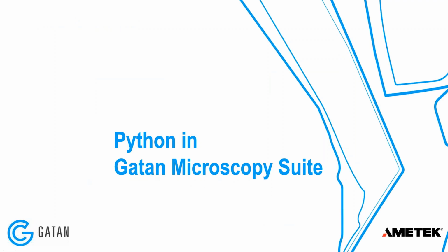So I'm really excited to be presenting today about Python in GMS, and as Stephen just mentioned, I'm the in situ applications person at Gatan, and you may have noticed that doesn't really have anything to do with software or coding or scripting or Python.